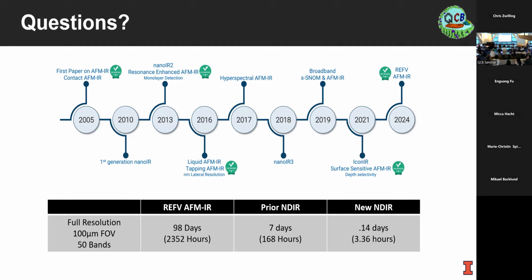But that problem is either ill-conditioned or ill-posed, though we created a new one recently that might be better. And in those types of analysis, noise is a huge factor. Any small error in your measurements, when you try to invert that, just blows up. So getting the highest quality expansion measurements with the lowest noise is what we need. Then potentially we take multiple pulsing frequencies and recover 3D depth down to a couple hundred nanometers with 10 to 50 nanometer resolution or something.